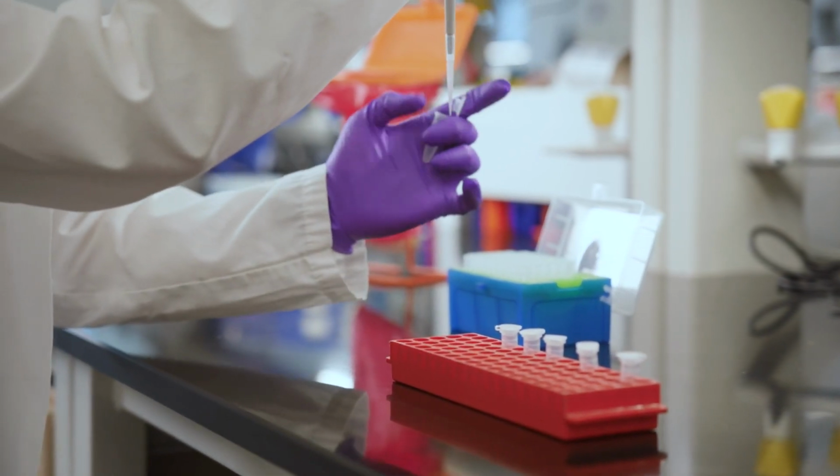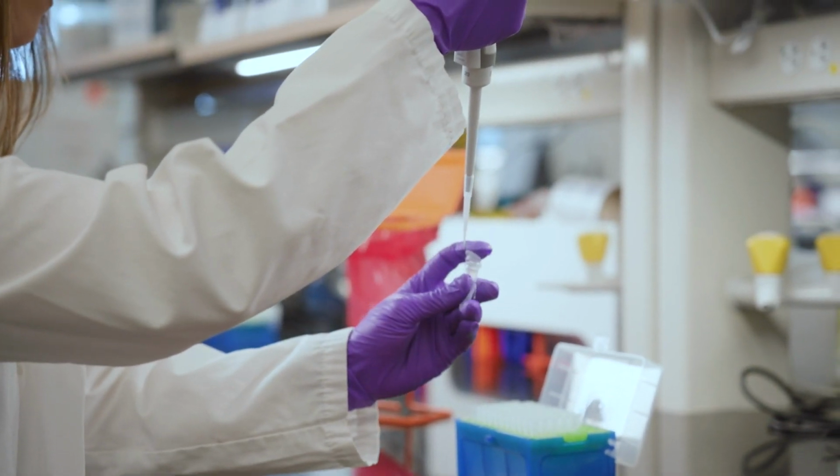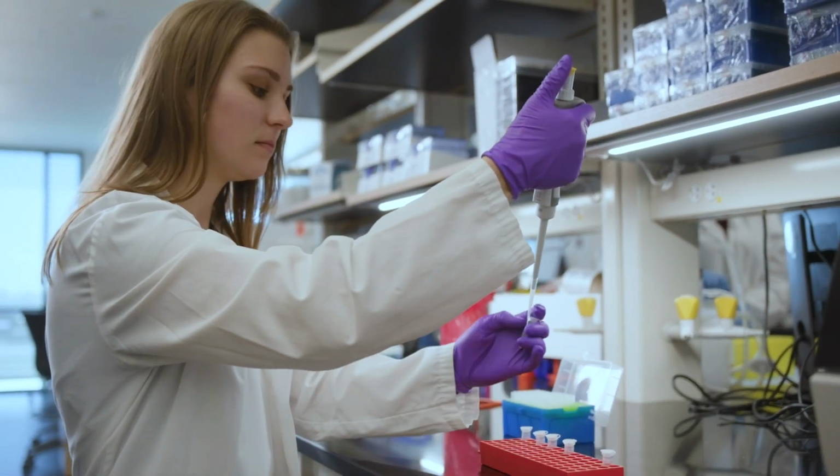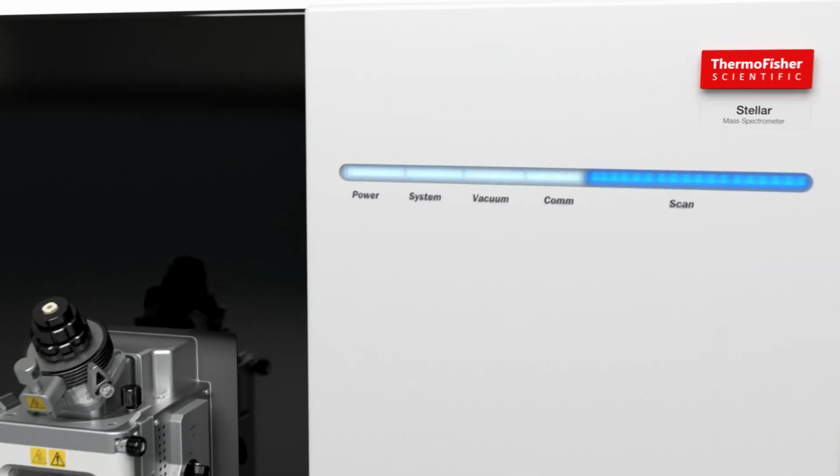And our goal for this was to see, is it possible to dial back the amount of material that we need to make a good quantitative measurement in a similar or faster throughput way onto the Stellar mass spectrometer, and to see how much of the workflow we could actually do on the Stellar mass spectrometer alone.